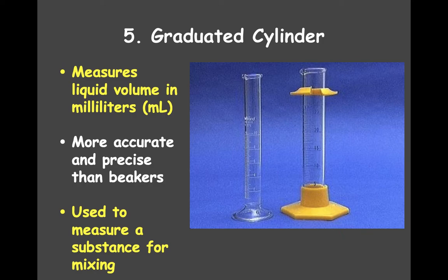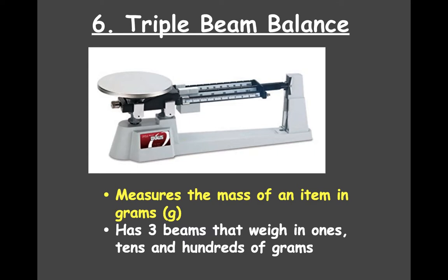Now, just like a beaker, these come very, very large. There's very, very tall ones that go up to 1,000 milliliters or more, and itty-bitty tiny ones. When you use any type of glassware, you want to make sure that you check out the reading on it. Sometimes the lines are spaced by 2. Here we have 2, 4, 6, 8, and 10. On this one, it goes 5, 10, 15, 20. So anytime you use any glassware or any piece of equipment in lab, you want to make sure you look at the numbering.